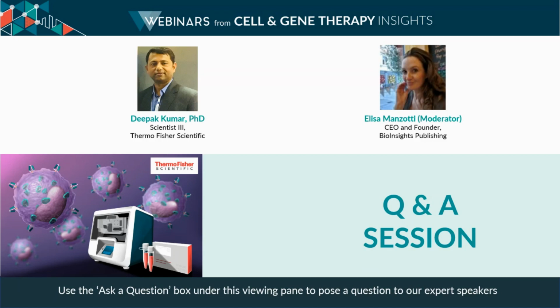Great, thank you. And another question from the audience. Can you cryopreserve the NK cells after expansion? That's great. Currently, we are working on that one. I can see many papers that discuss cryopreservation for NK cells. The problem is that once we thaw, the expression of CD16 goes down, and we are currently working on that one. Thank you for sharing. Great.